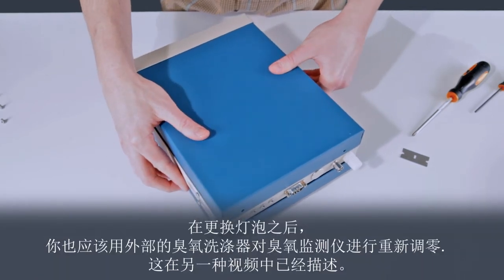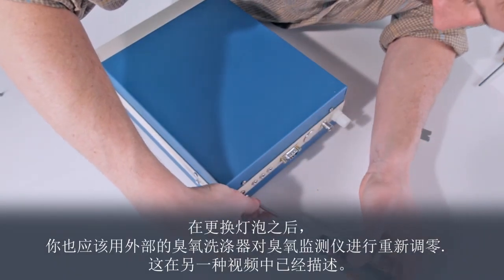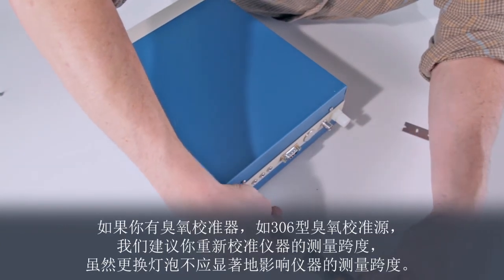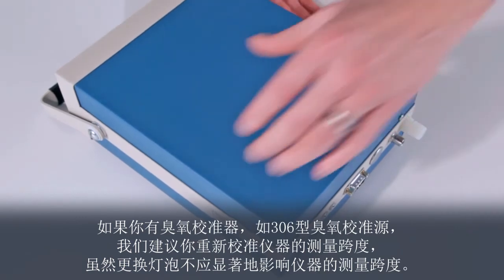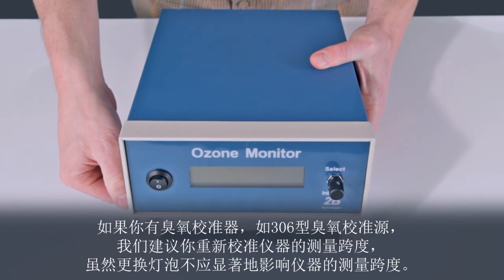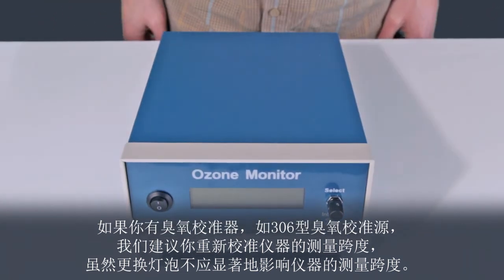After changing the lamp, you should also re-zero the ozone monitor using the external ozone scrubber as described in another video. If you have an ozone calibrator such as the model 306 ozone calibration source, it is also a good idea to recalibrate the instrument span, although the span should not be significantly affected by the lamp change.